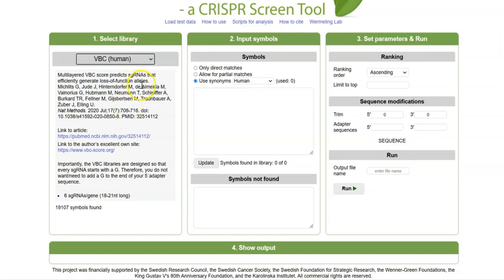And I want to say 2 things about this. One is that this one, in its design algorithm, wants to target conserved regions. It's trying to get the guides to target conserved regions, conserved over evolution then, and with the idea that this means that these regions that you target are encoding for protein domains that might be very important for the protein function.